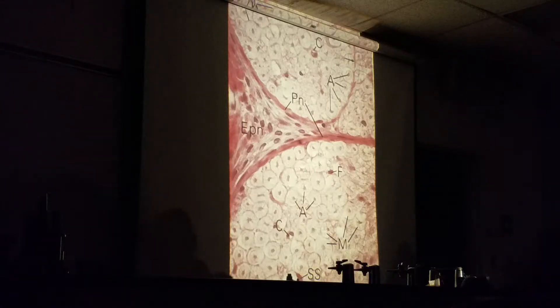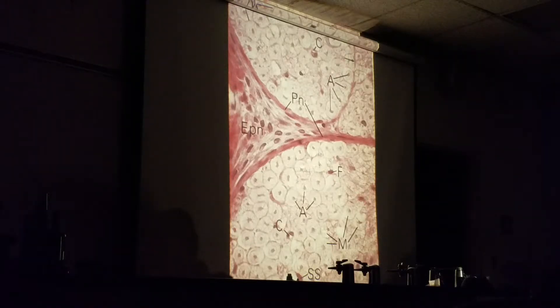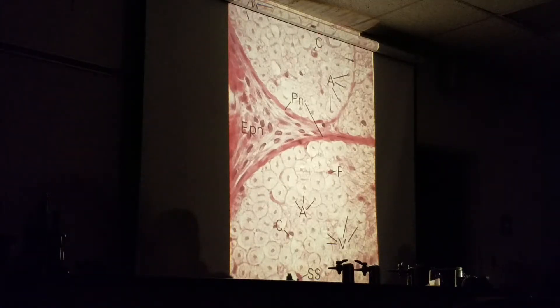Perineurium — see the difference in the thickness, very thick and very thin for perineurium. And then you have the nerve fibers, and it looks like you have a little tutu around them. The myelin isn't stained like it was in the other slide, where these are stained a dark brown color. That's the more natural staining of the peripheral nerve.